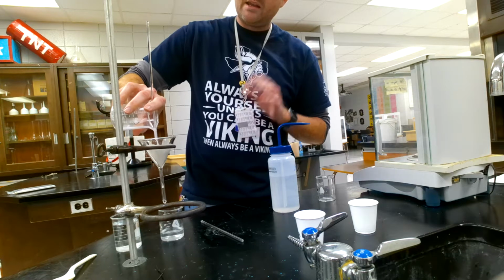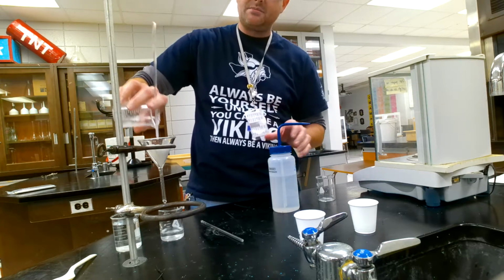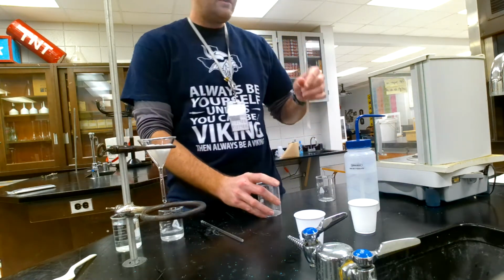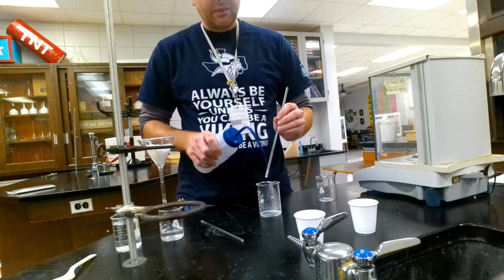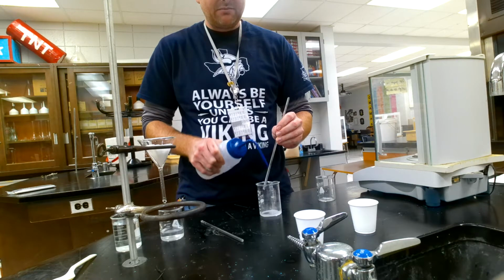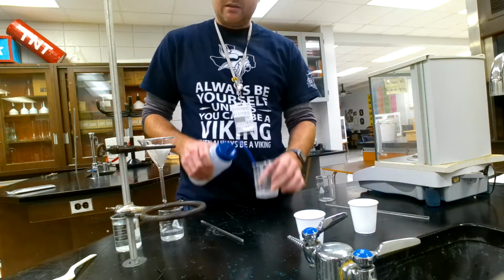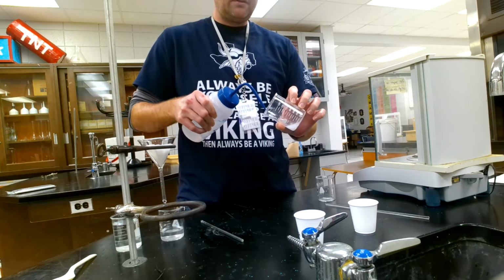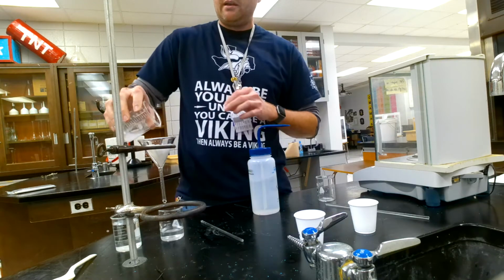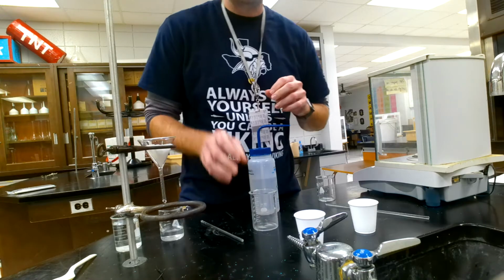This is an exercise in stoichiometry, not exactly your lab techniques, but if you were doing your IA or something like that, you would really want to pay attention to things like that. So again, I'll try to spray down the stir rod, get all that white stuff off there, and wash this out. It's going to take a couple of rinses, and I'll still add it to the filter, and that's how that works.